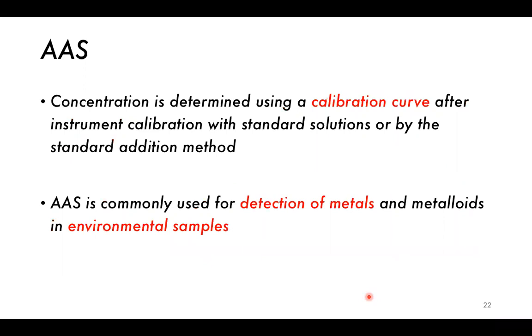Concentration is determined then using a calibration curve, after instrument calibration with standard solutions, or by the standard addition method. We learned about those back in module 1: the standard addition method, instrument calibrations, our linear regression, our calibration curve. We would measure out standard solutions, and that's only really possible for simple cases.